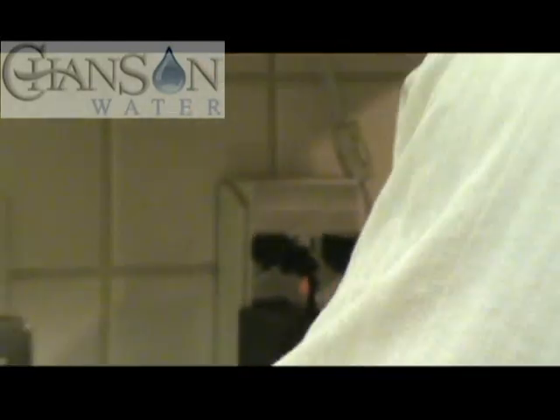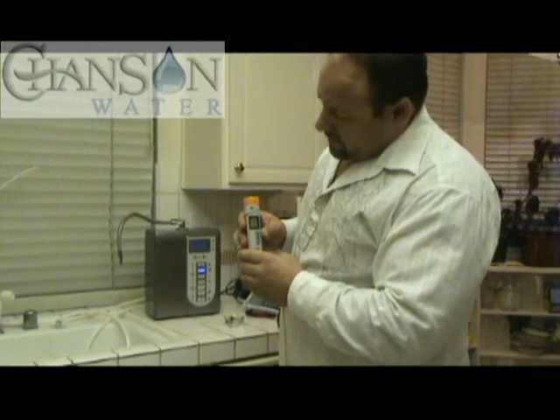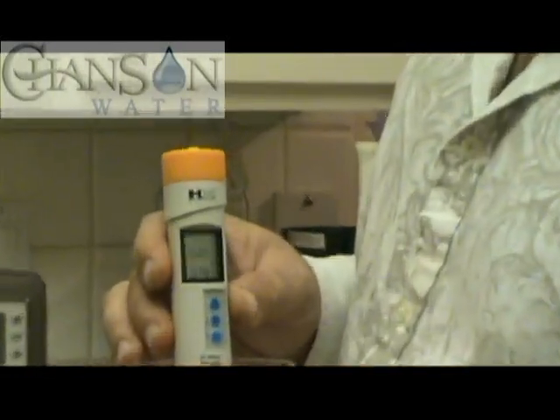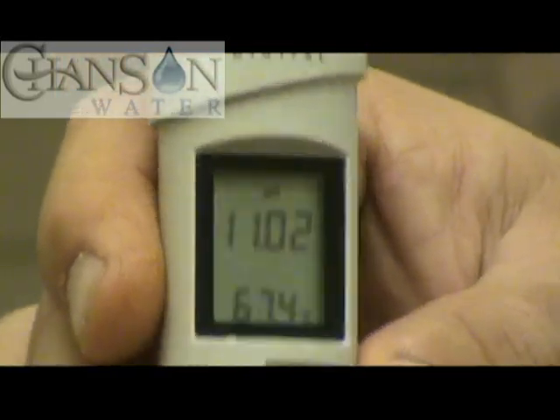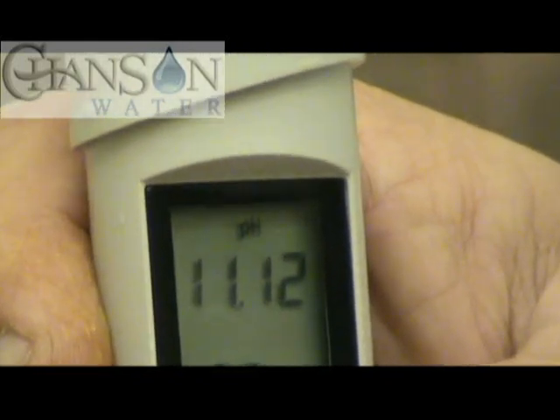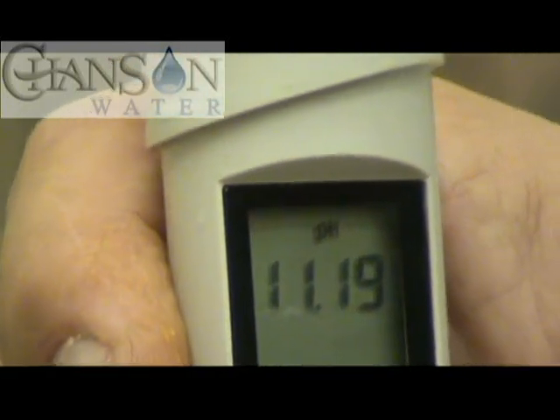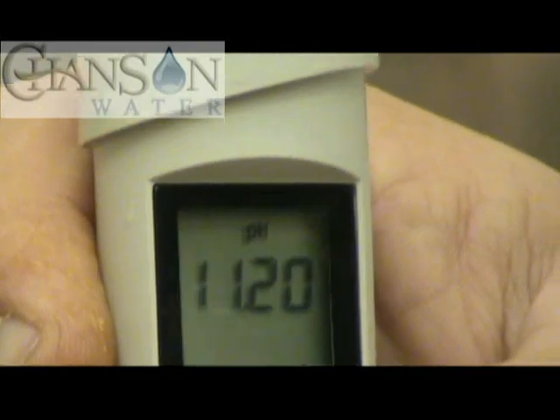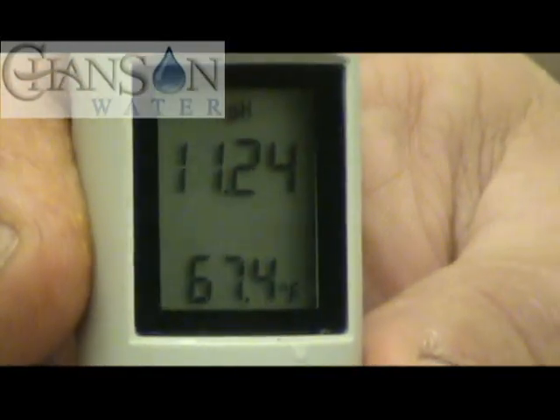Let's see what our pH water is. Give it a second to reach its numbers — whenever you use these meters to go back and forth between alkaline and acidity, they don't really like that and they take a little while to get to their numbers. At the pace we're going, we're going to end up at about an 11.3, but I'll accept this for the test. We've got an 11.2.